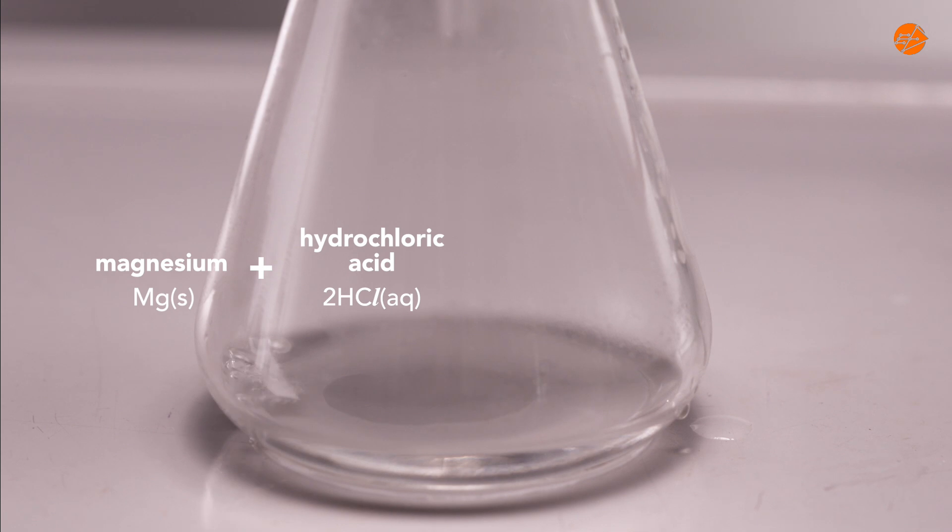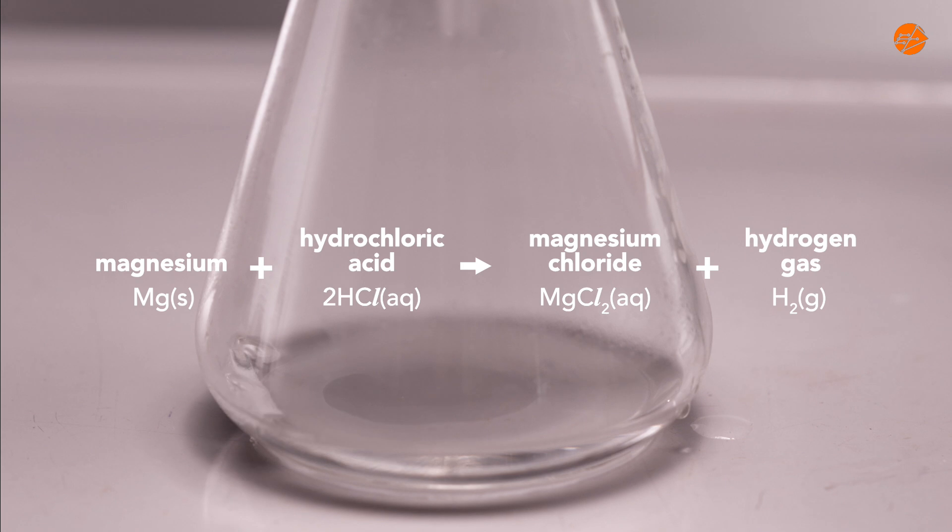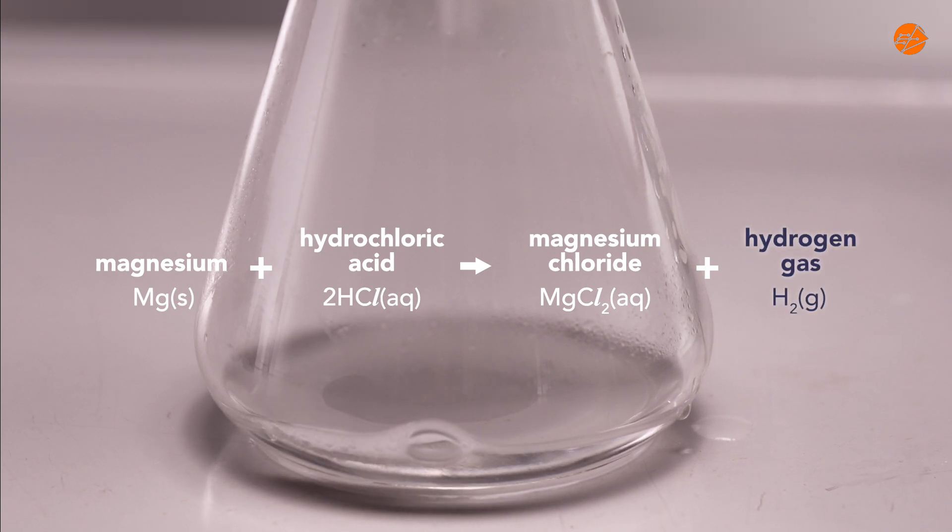In the reaction between magnesium and hydrochloric acid, magnesium chloride and hydrogen gas are produced. We can collect the hydrogen gas through displacement of water.